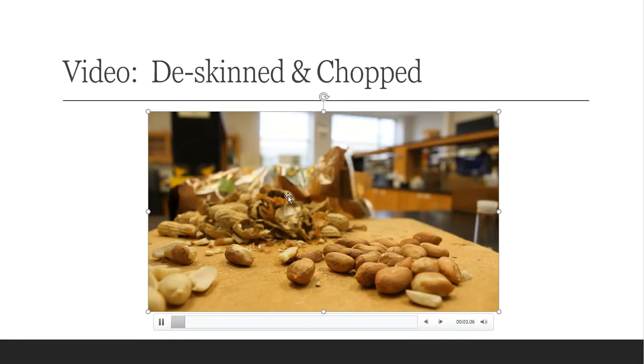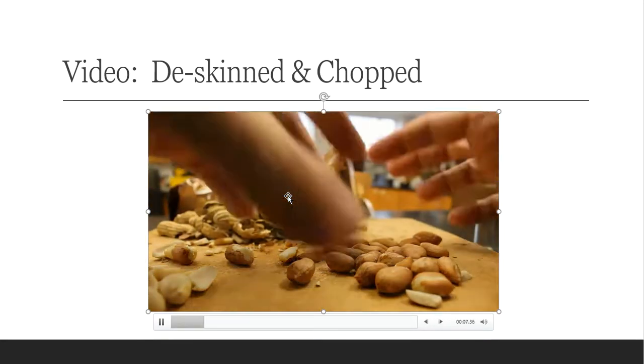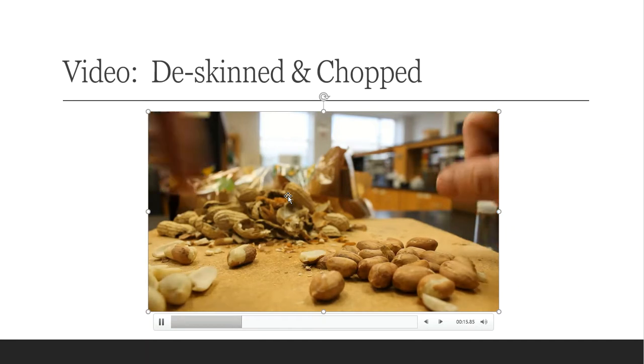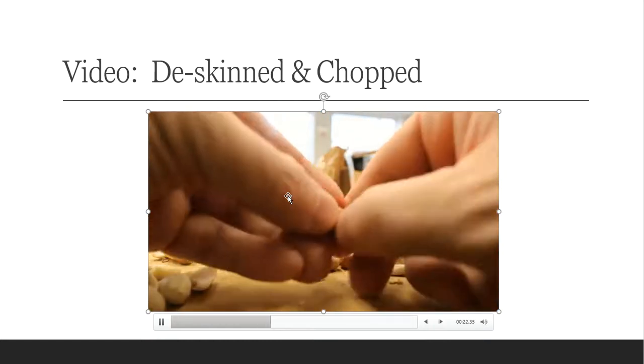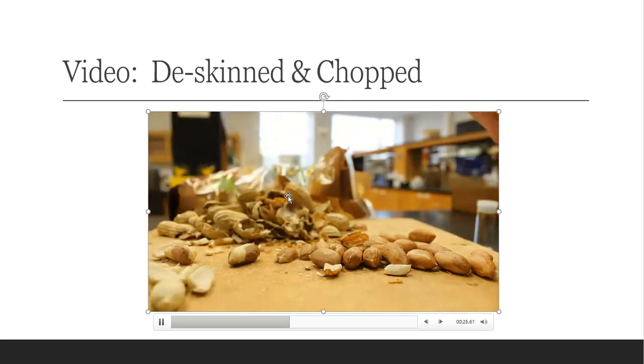Okay, so here's my peanuts. And I've just cracked open the shells right there. You see a mound of peanuts that are here. I'm probably going to have more than this, actually, but this is a good place to start. But the problem with this process is that the skin has got to be removed, people. I've got to be able to get the skin off. So I just give it a good rub, and the skins come off.